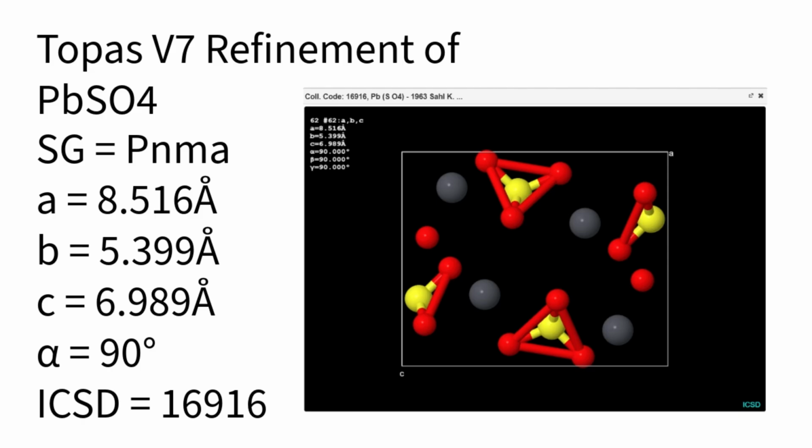The first part will consist of Pawley refinement. We will extract the unit cell parameters, and then from that we can focus back on the atomic positions.